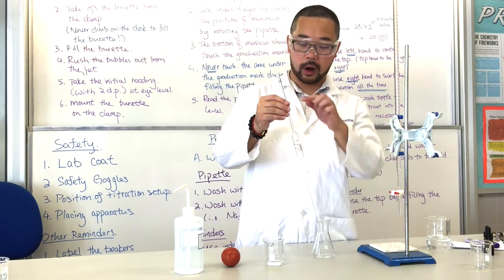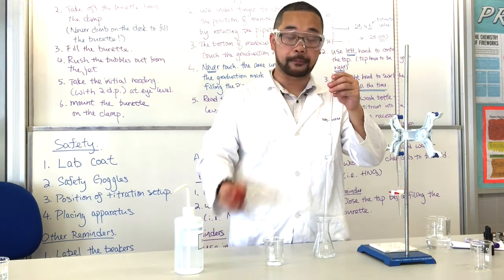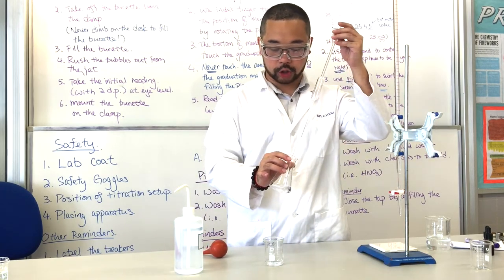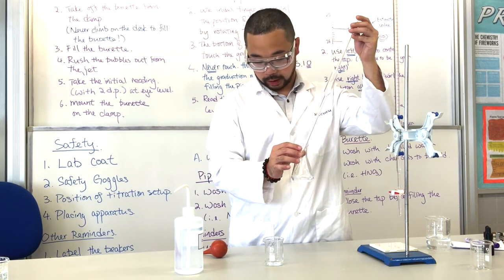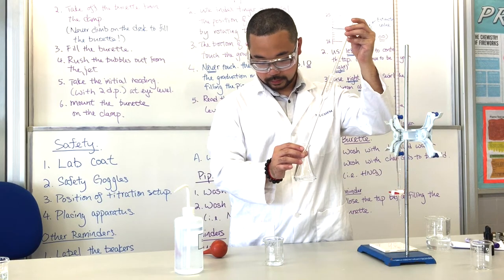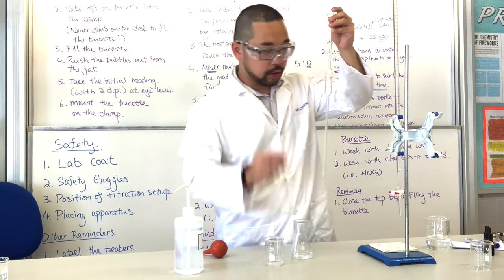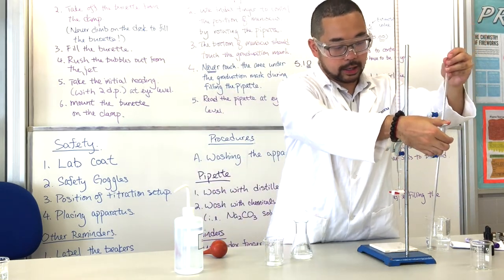Remember, the last drop of the liquid in the pipette, you should not blow out. What you need to do is touch the tip of the pipette to the surface of the liquid, like this. After that, you can clamp the pipette onto the clamp again.